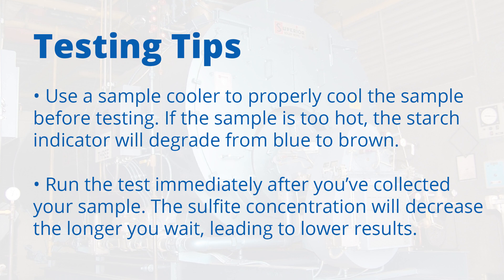When performing a sulfite test, it's important to use a sample cooler to properly cool the sample to room temperature before testing. If the sample is too hot, the starch indicator will degrade from blue to brown. It's also important to run the test immediately after you've collected your sample, as the sulfite concentration will decrease the longer you wait, leading to lower results.